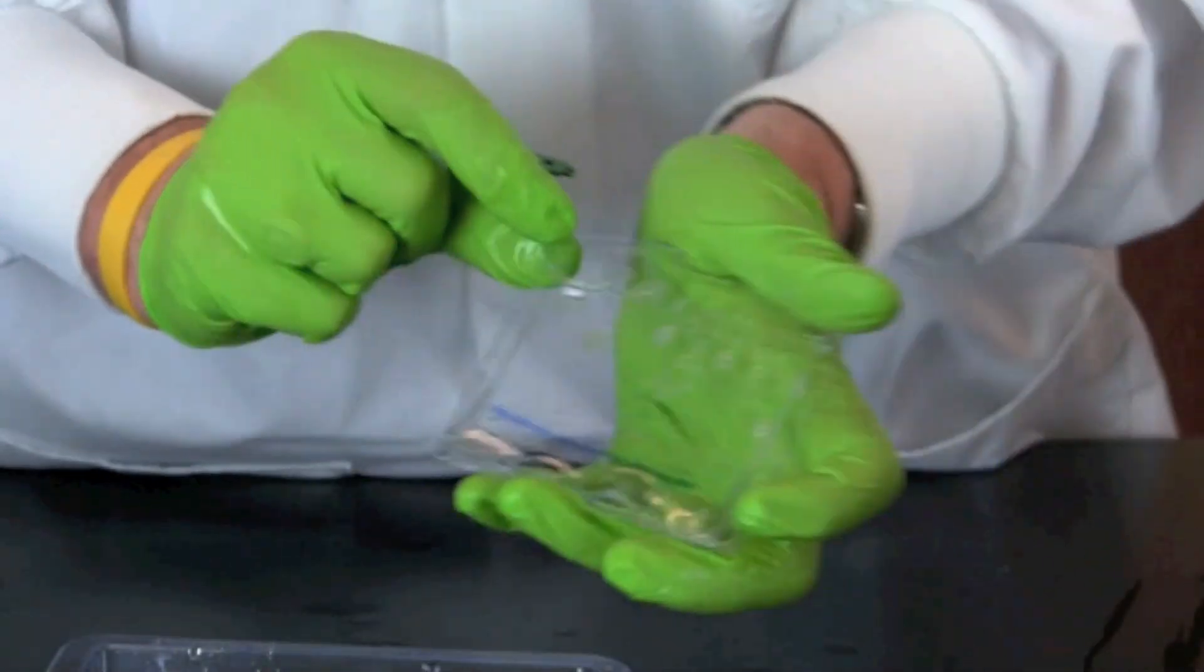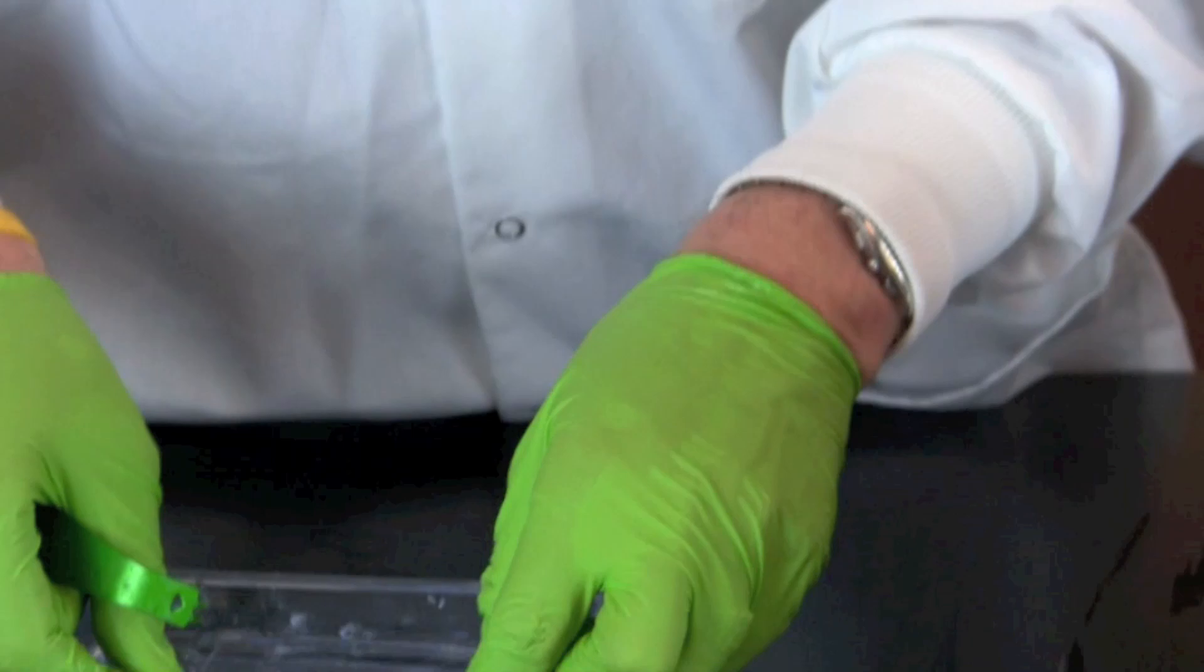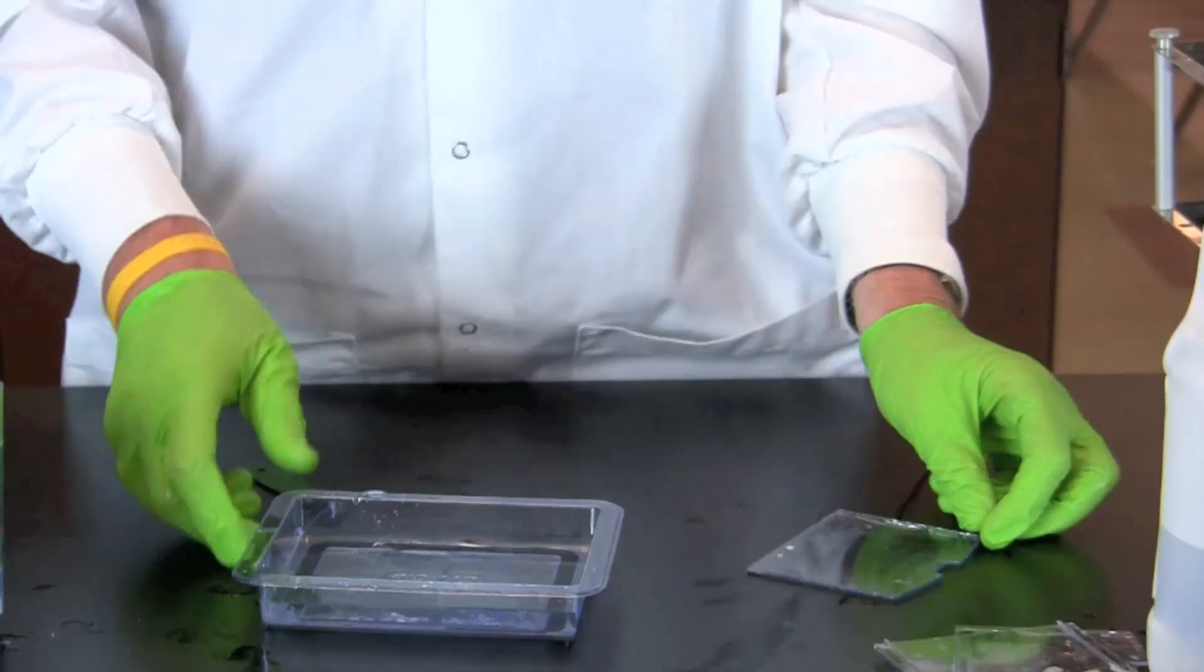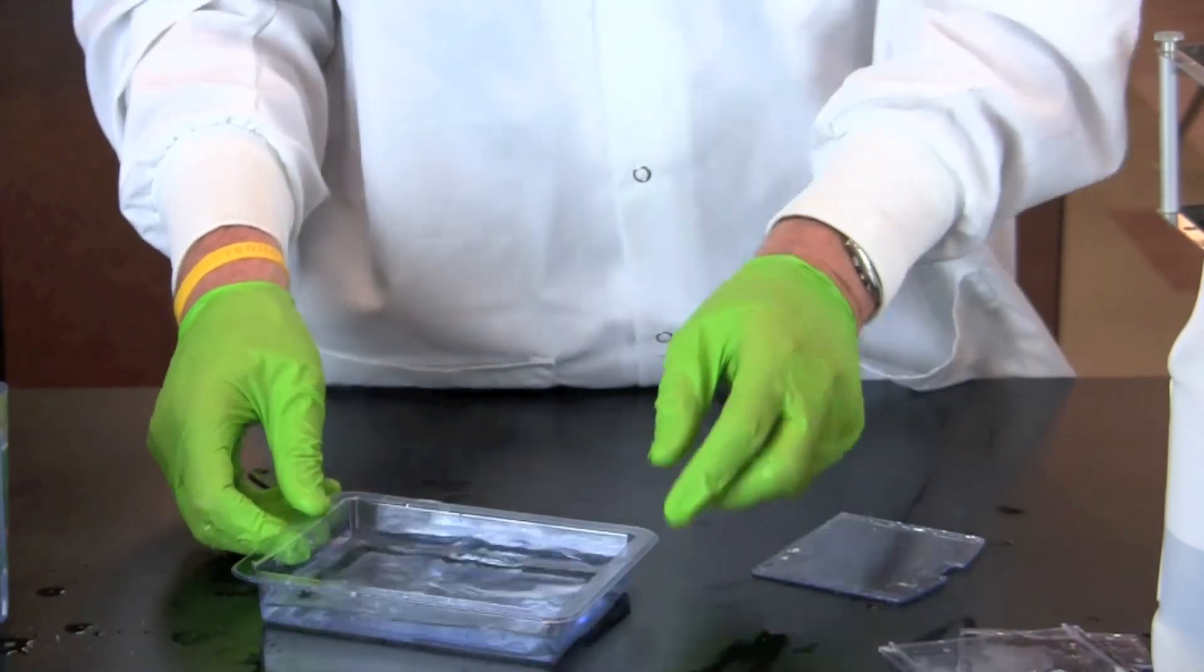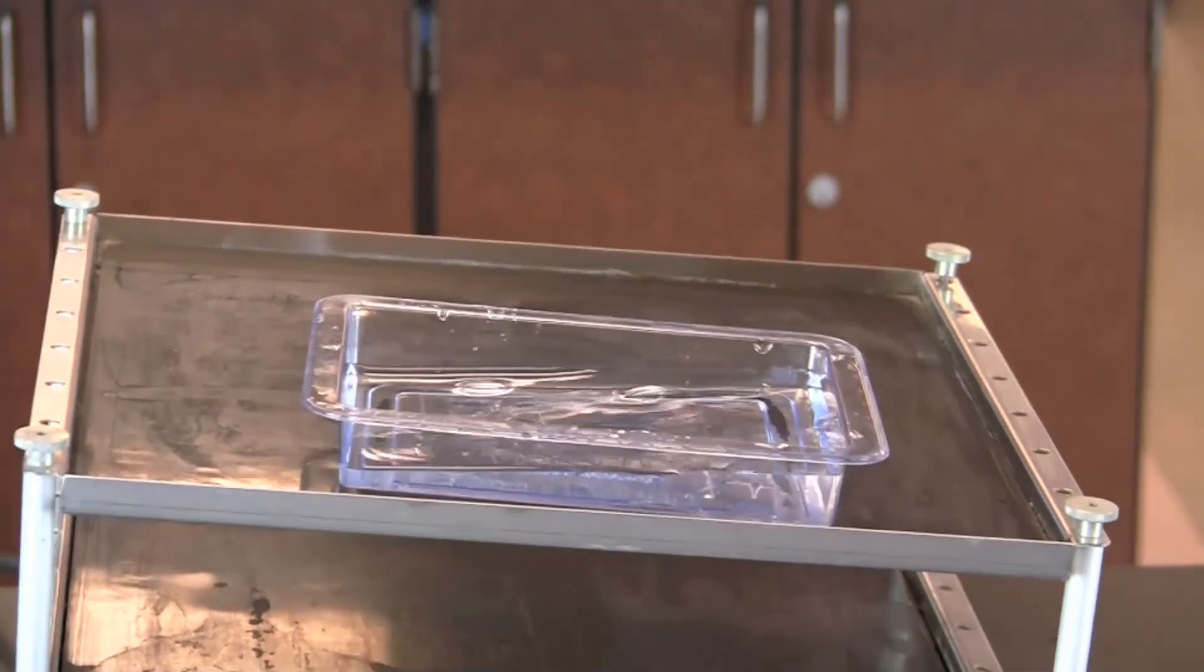Very gently transfer the gel into a staining tray filled with tap water. If time permits, rinse the gels three times for five minutes. This will remove chemicals and provide for better staining.